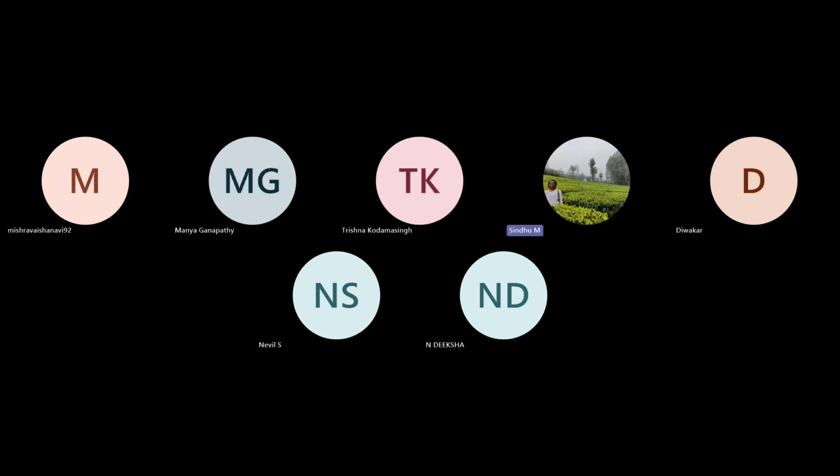You may think that the raw data will take more storage space because it has all the metadata as well. So you might think that from the CZI file, you open it in FIJI, and then the JPG format may have lesser storage space, so you can export to JPG and delete the raw data. But please don't do that. Then all the important pixel information from the image would be lost.